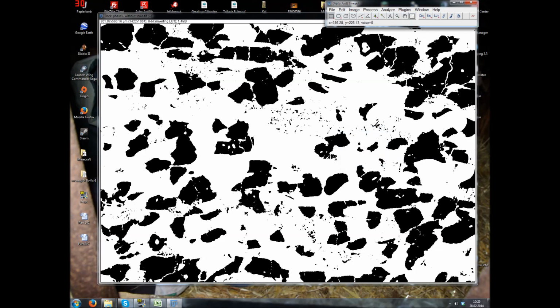Then we just have to do some handwork and erase these remaining points. Just right click there, then you can use this tool.